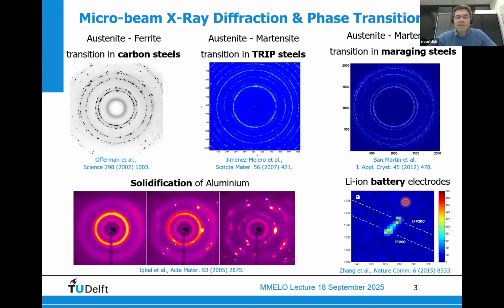So I have different research interests. Typically, it's a combination of materials and advanced radiation techniques, specifically neutrons and synchrotron X-rays. This is an example of the work we have been doing with synchrotron radiation. It's specifically on what you can learn from microbeam diffraction.